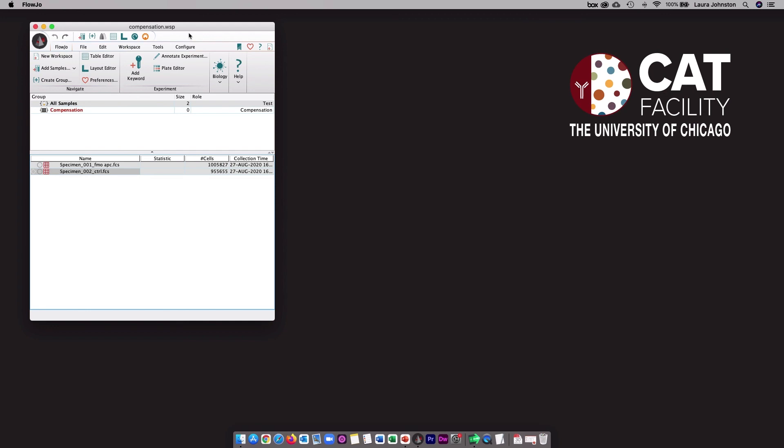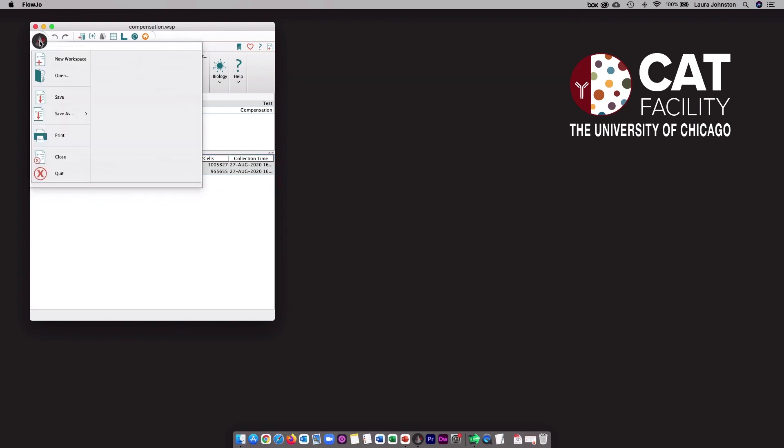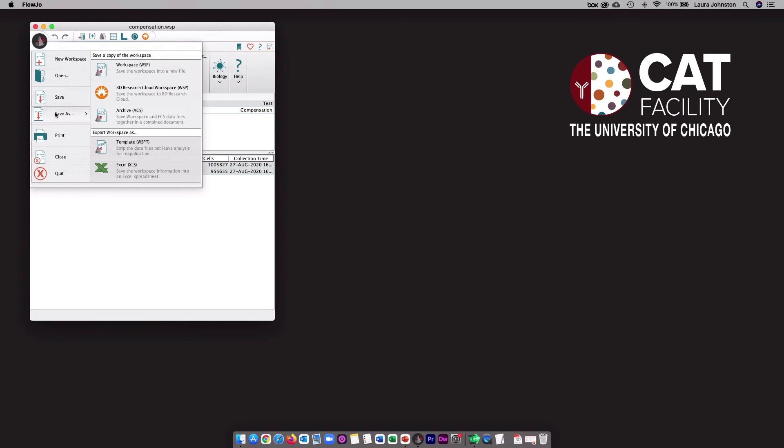To simplify things, you may choose to save in a different format. If you click this button here and then go to save as, you have the option to choose an archive file. So instead of the WSP file type, it will be an ACS file. And if you save it in this format, it will package everything: the workspace, the FCS files, and the compensation matrices. If you share an ACS file with someone, it will be the larger file size, but they just need to open it and it will be ready to use.